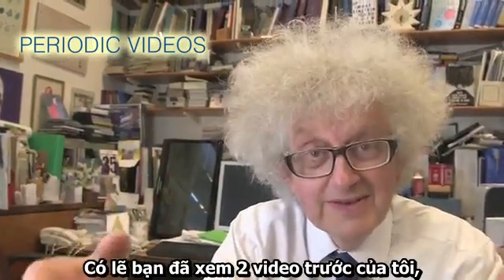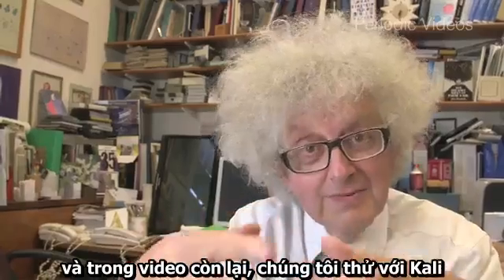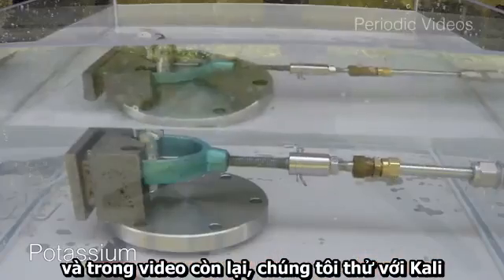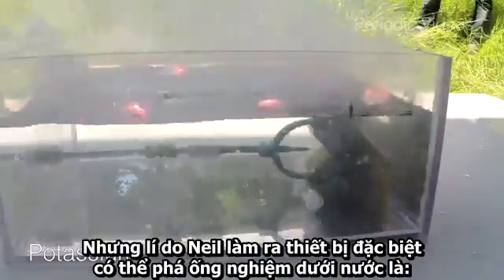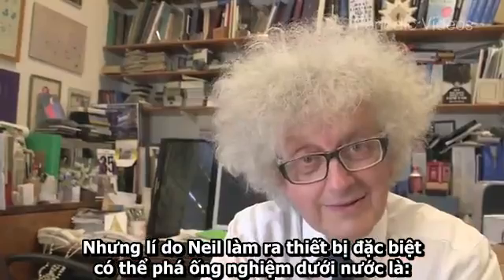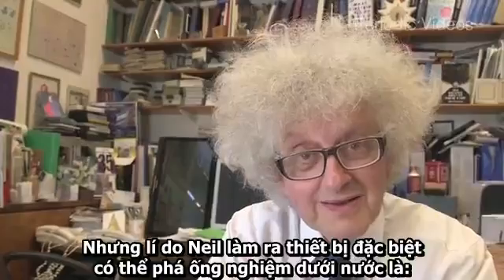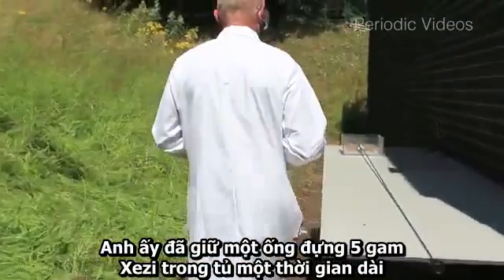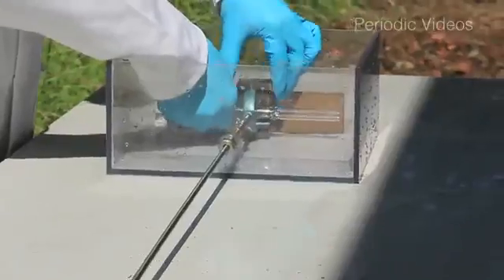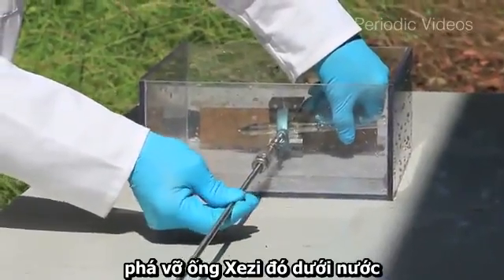You've probably seen our last two videos — one about breaking a tube of sodium underwater, and the next one breaking two tubes of potassium underwater. Now the real reason that Neil devised his special device for breaking glass tubes underwater was because for years he's been holding a five gram sample of cesium in his cupboard and he wanted to see what would happen with breaking that cesium underwater.